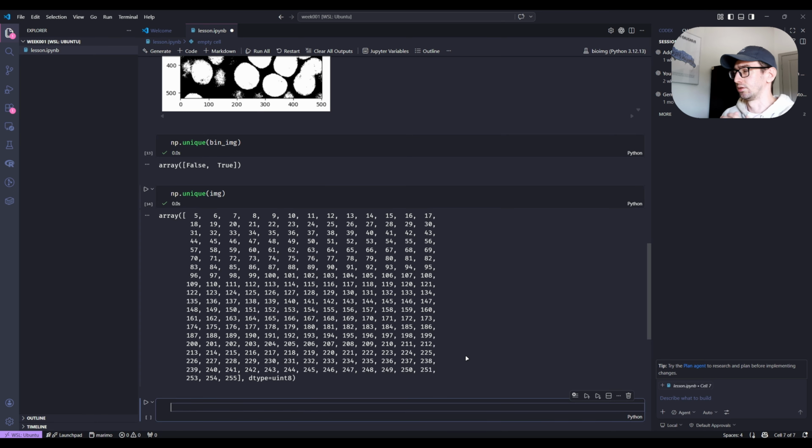And this is really important to keep in mind because, for example, the big images of spatial proteomics could easily be, for example, 60 gigabytes in case you try to load them to the RAM. And if you try to load them to RAM, if you're working on, for example, your laptop, you'll face a problem with memory overflow.